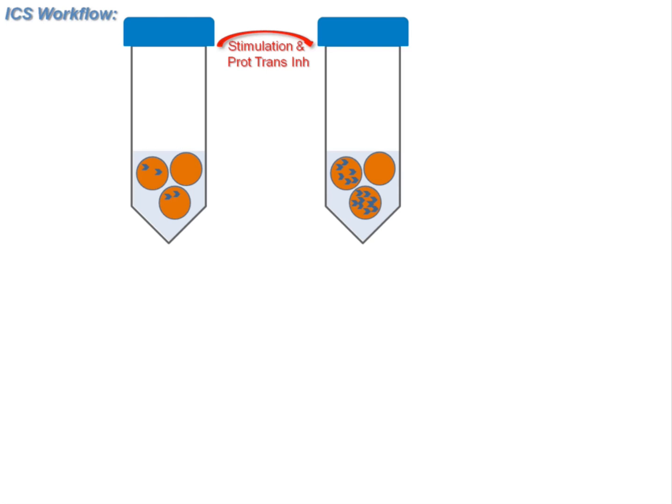Now, it's important to mention also that it depends really on the system in place. Sometimes the cells work best at just being blocked for the last few hours. Sometimes it works fine for the stimulation and the protein blocking to be treated together. And again, this is an optimizing thing. In my hands, for a lot of applications, stimulating as well as the protein blocking at the same time is fine, but you might find that protein blocking leads to excess cell death. Again, things to consider.